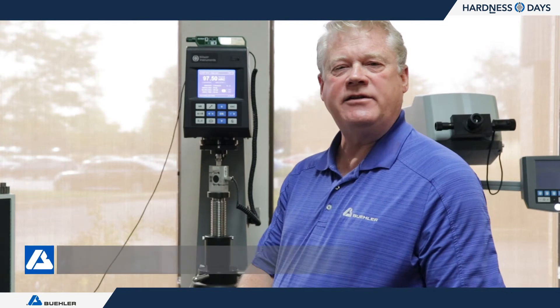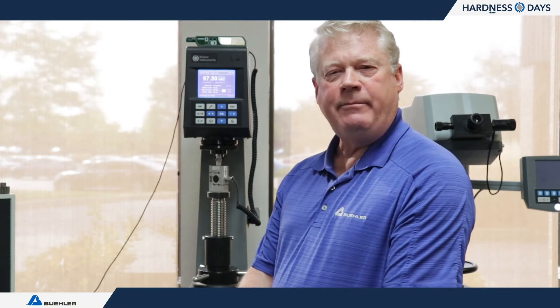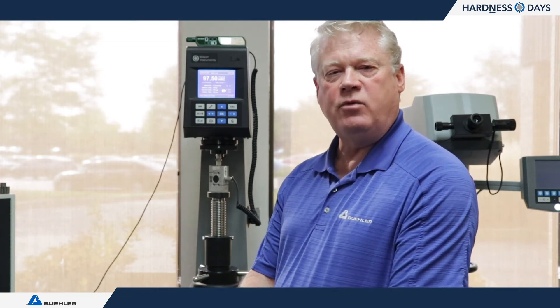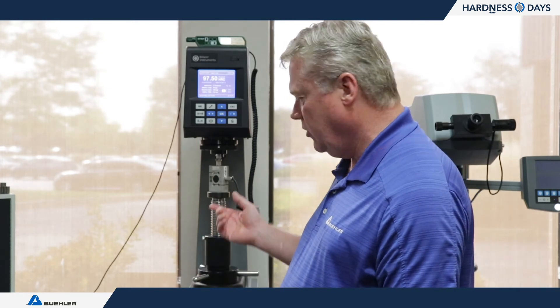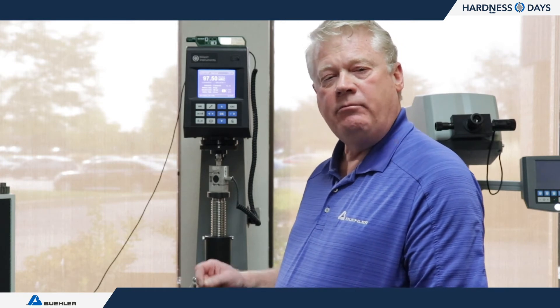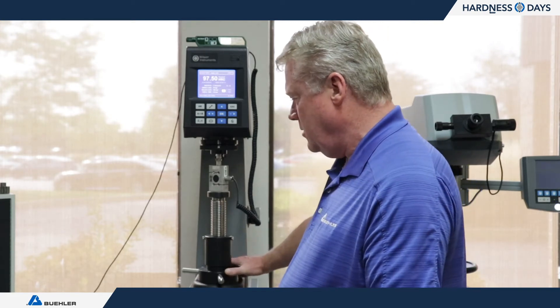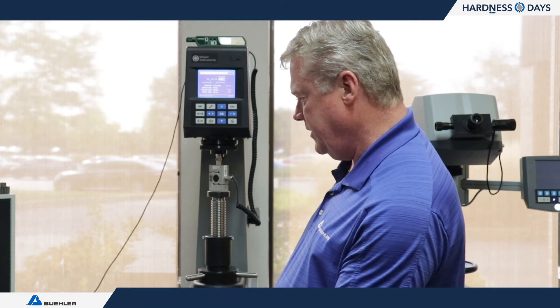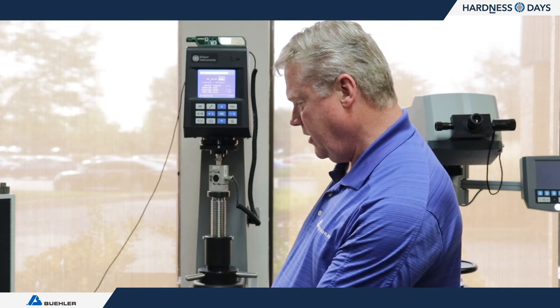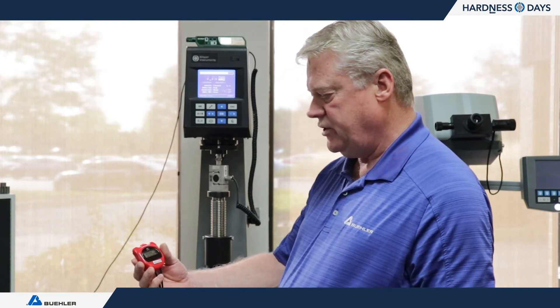The next section of E18 is timing. Although it's not required as part of a normal direct verification, due to a NADCAP advisory that came out a couple of years ago, we've been doing it on site so customers have paperwork showing timing is compliant. We use a load cell and a stopwatch to measure the ramp up from minor load to major load, and hold until it releases the major load. As soon as we see it change to major load, we start the stopwatch. The spec is 2 to 8 seconds — this machine is at 5.29 seconds.